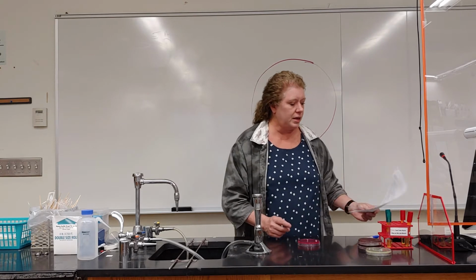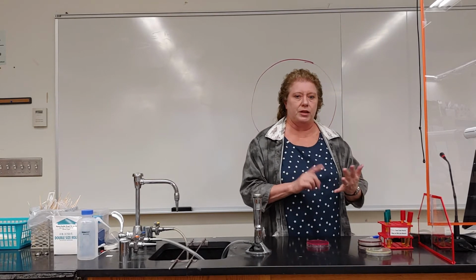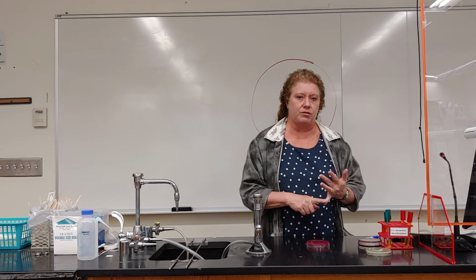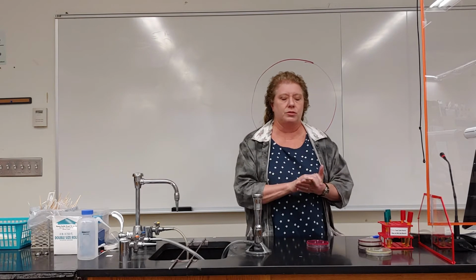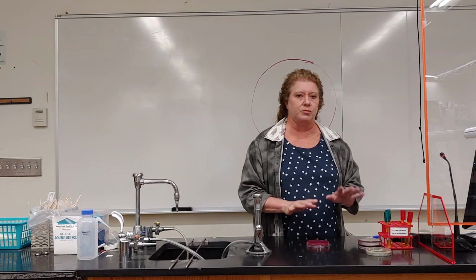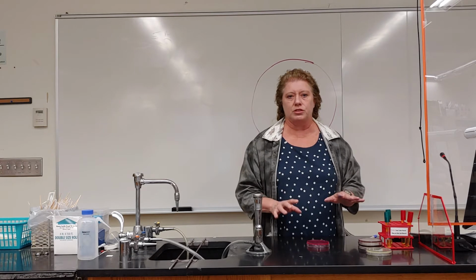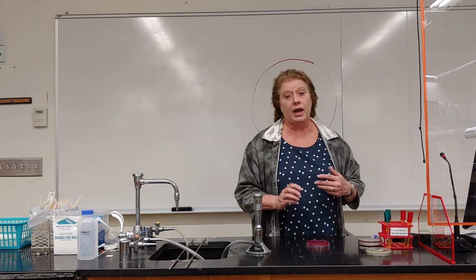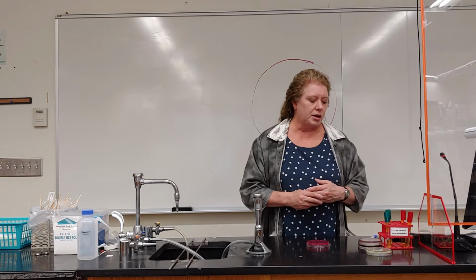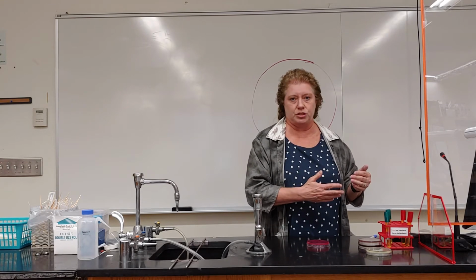So today we are going to be using 4 different bacteria. You'll see them listed: E. coli, Proteus vulgaris, Staphylococcus aureus, and Staphylococcus epidermidis. We're using those 4 bacteria to show how the selective and differential medias work, so that you can see what different outcomes of results would look like. So that if you had an unknown bacteria, you would know what kind of results you were reading.